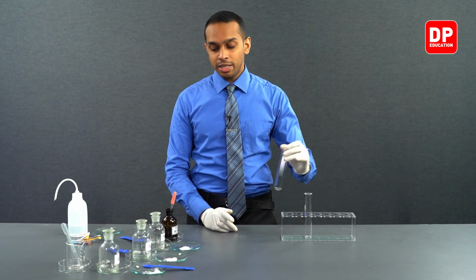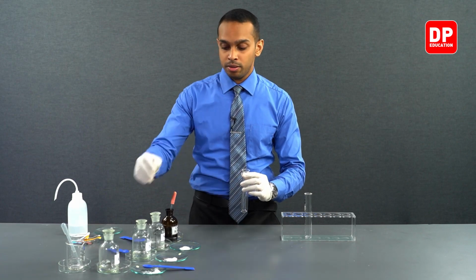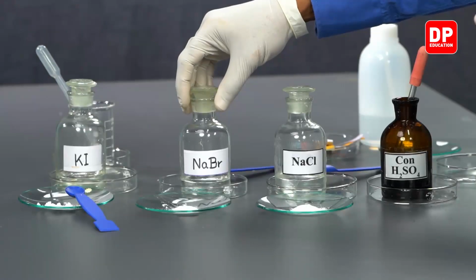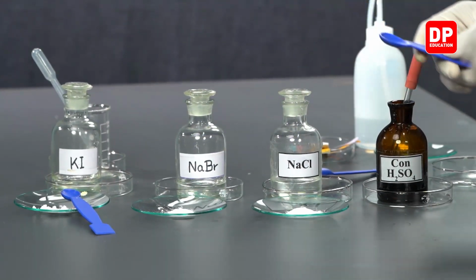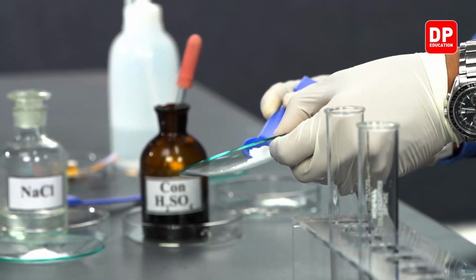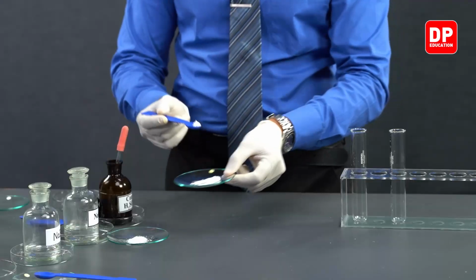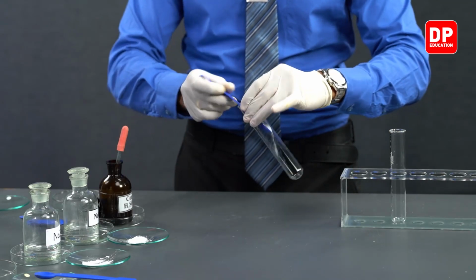So let's move on to our second halide ion, which is sodium bromide. We'll take a little bit of the sodium bromide solid and we'll add it to a boiling tube like this.